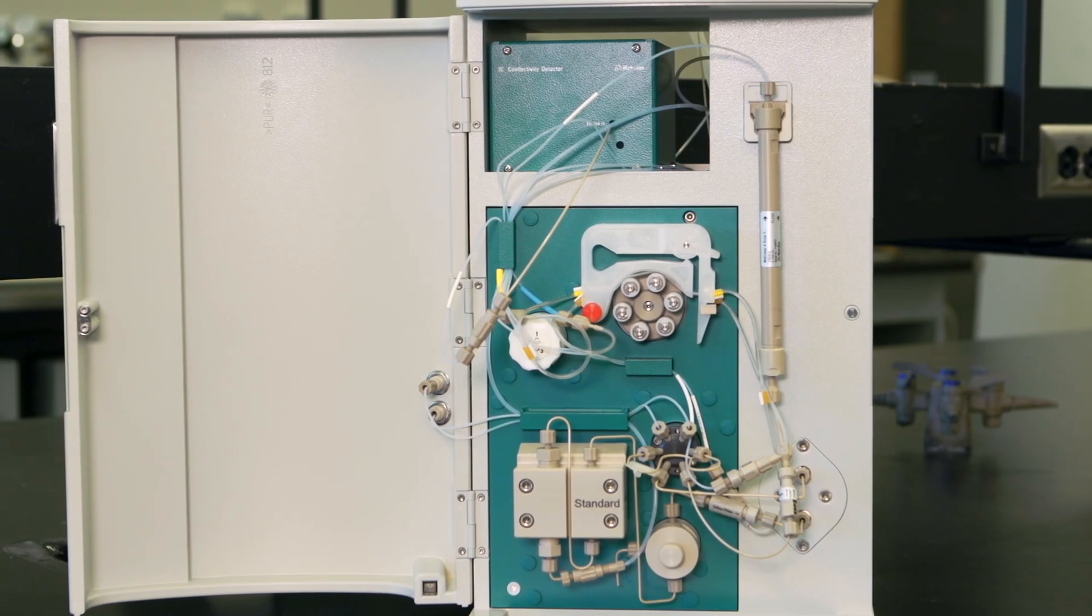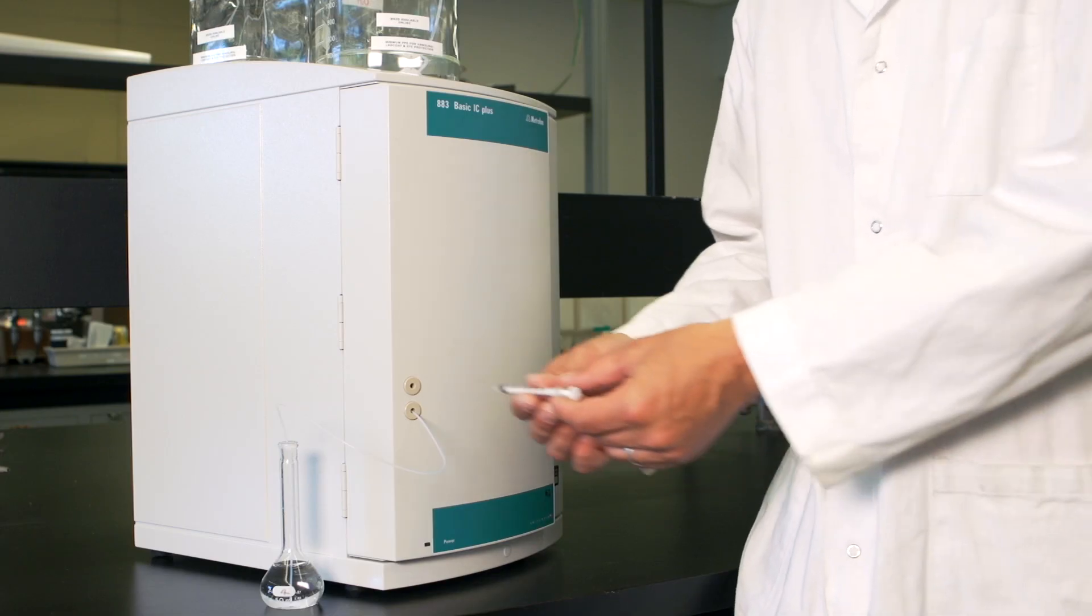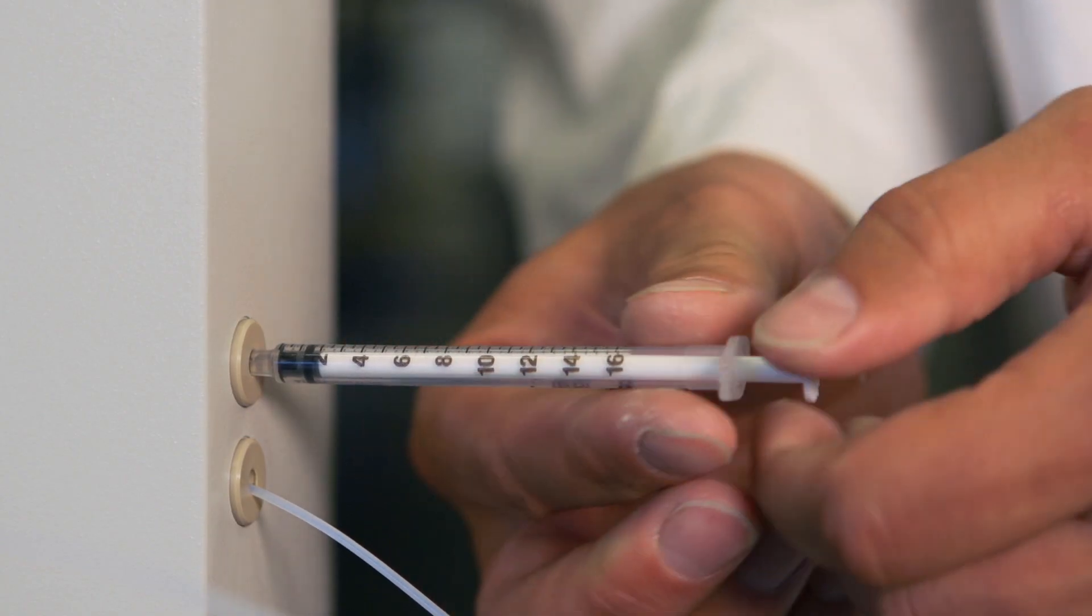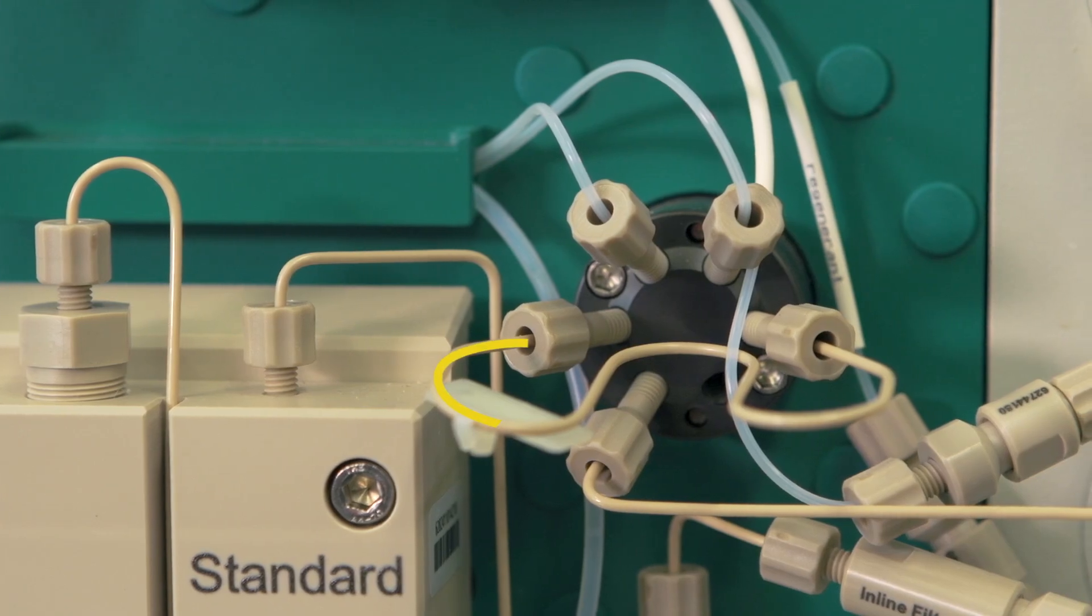Once the eluent is flowing throughout the instrument, the sample is introduced. The analyte is introduced into the sample loop by suction. Use of the sample loop allows for reproducible sample volumes.